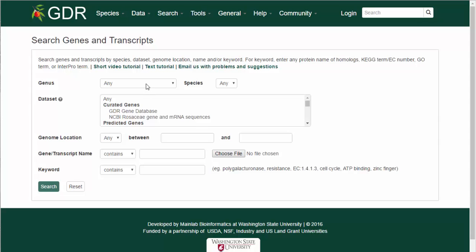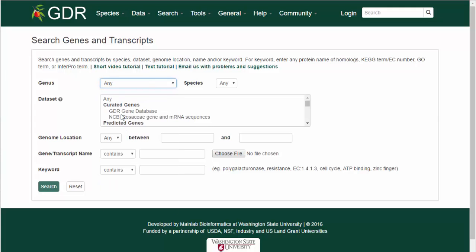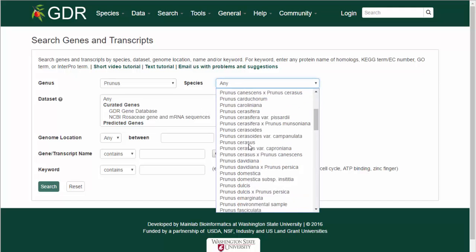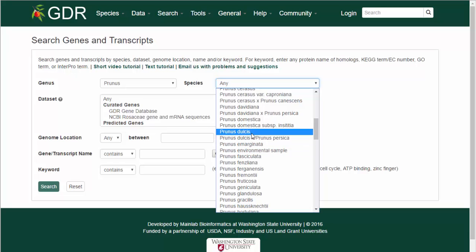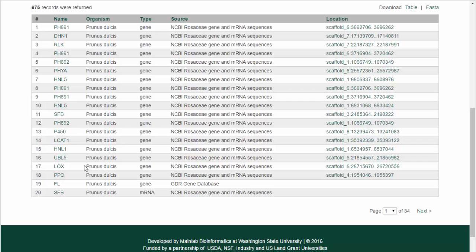The search can be limited to a certain genus and species. Once a genus has been selected, the species list will be populated, and then a species selection can be made. Once the selections are made, hit Search, and the results are returned as a table with hyperlinks to more info.